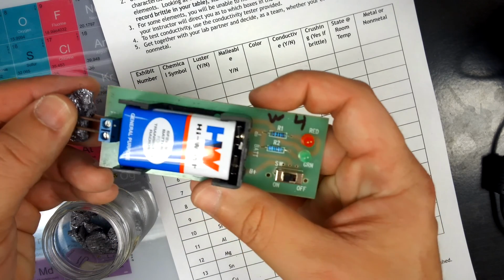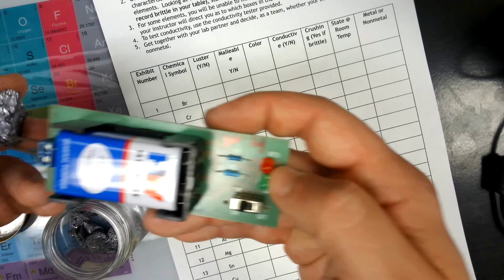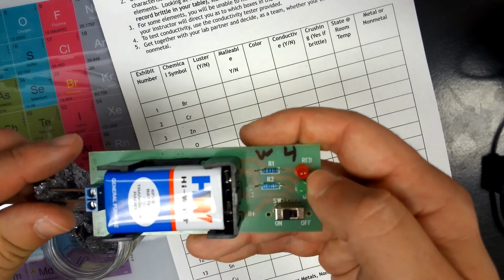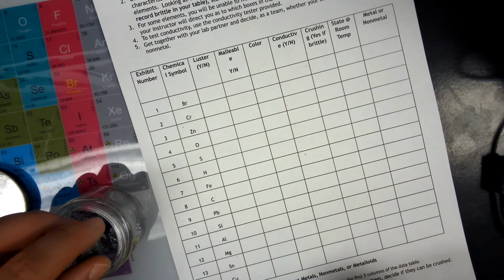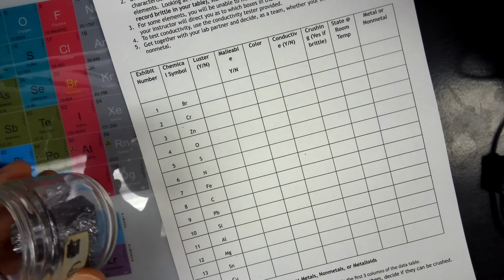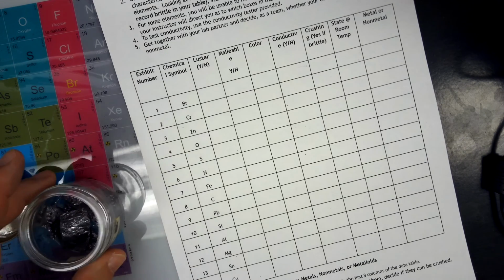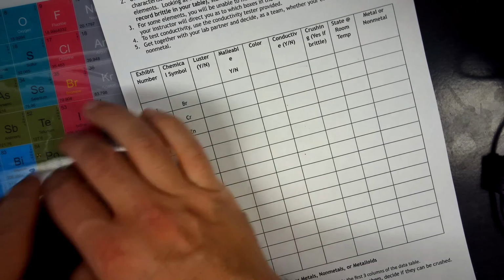Conductivity, just barely, like maybe a little bit. Not so much where it's not shiny. Crushing looks like not really. Maybe. Doesn't look crushable to me. Maybe if you hit it with a hammer. And it's a solid at room temperature.